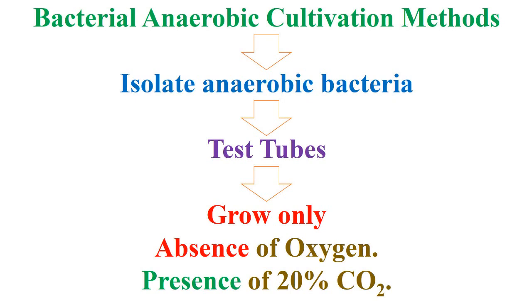Welcome to the Genetic Teacher channel. Today, we are talking about bacterial anaerobic cultivation methods, which isolate anaerobic bacteria in test tubes that grow only in the absence of oxygen and the presence of 20% carbon dioxide.